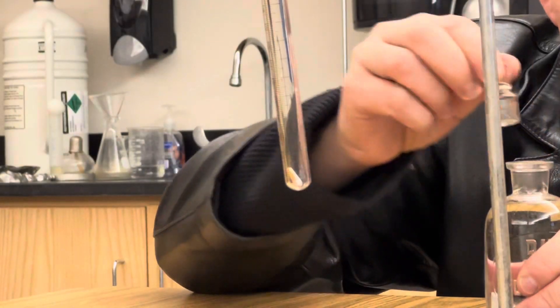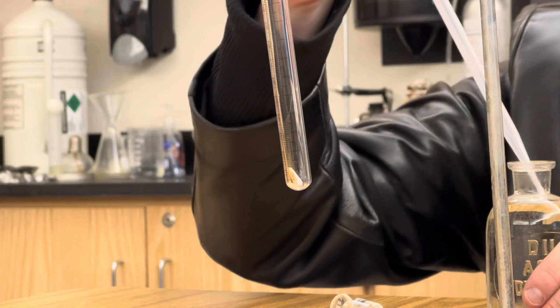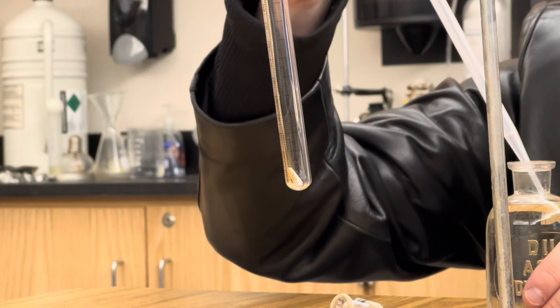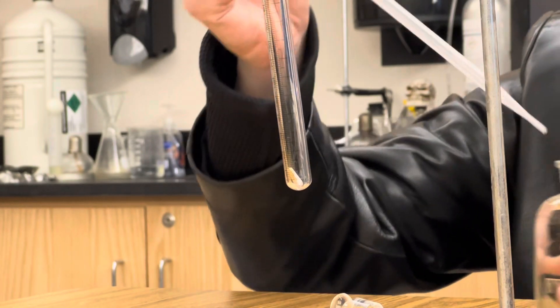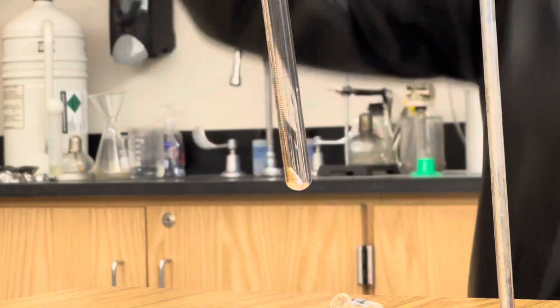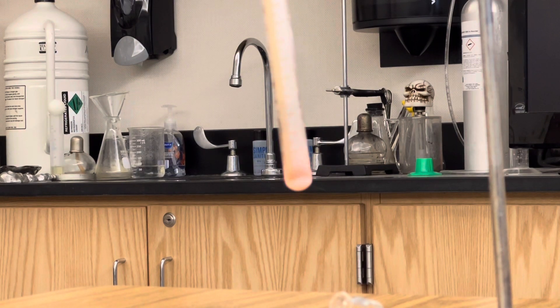The next step is we're going to very slowly add a drop of hydrochloric acid to our test tube, and the reaction will be immediate. Check this out. There he goes.